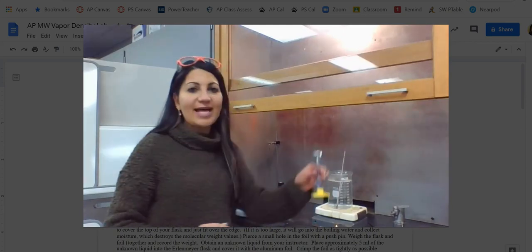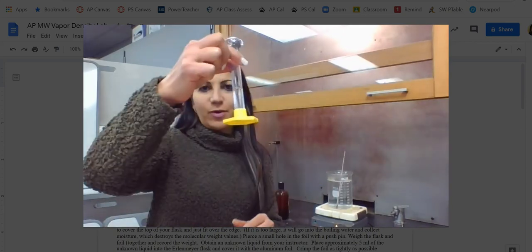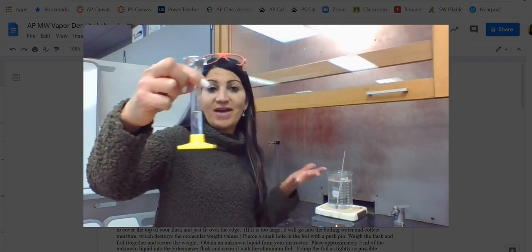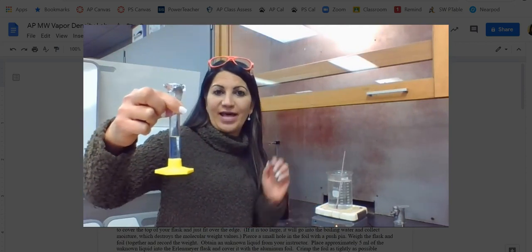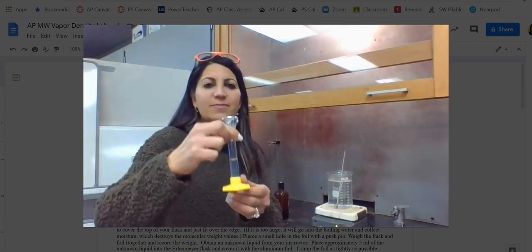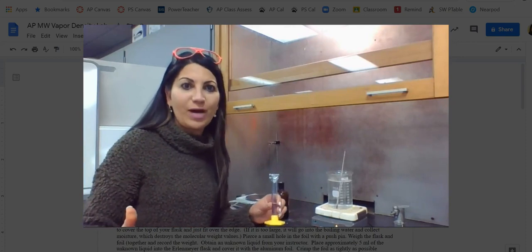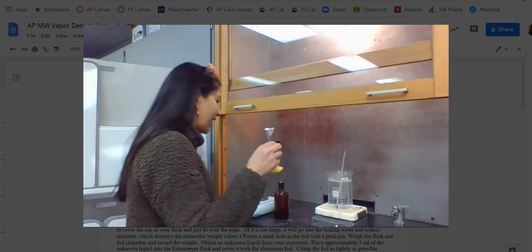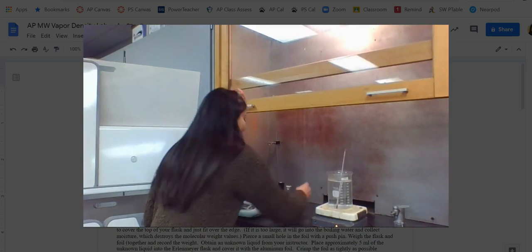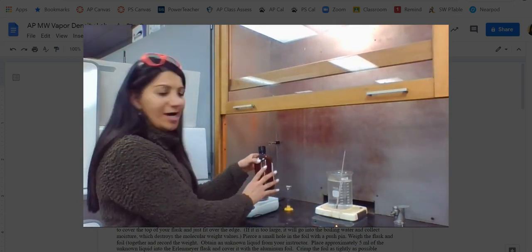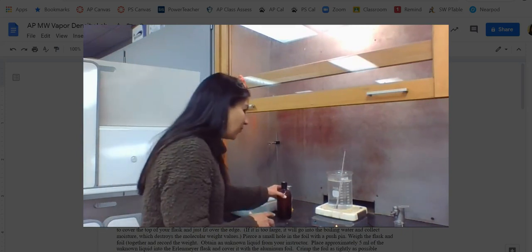Now, it doesn't start off as a gas. You would each get a liquid inside of a vial, and so right now I have about 5 milliliters. We don't even have to record that because it's an about value. But it's about 5 milliliters of some unknown volatile liquid, which just means that it's going to vaporize readily or rapidly, so it evaporates quickly. The other thing that I have here is I have the container that it came in, but there would be multiple different ones here.